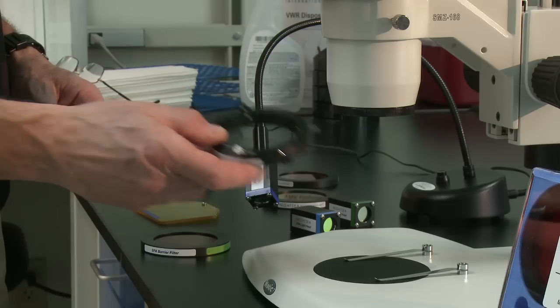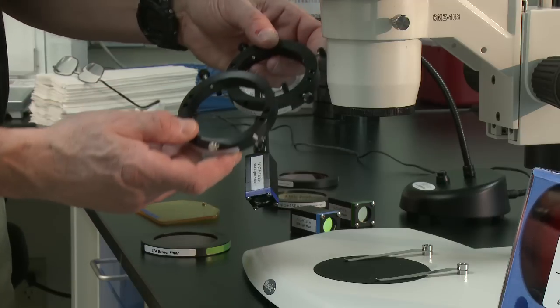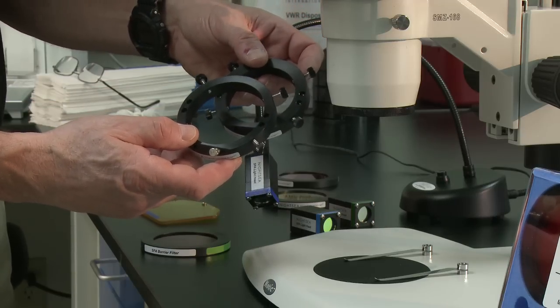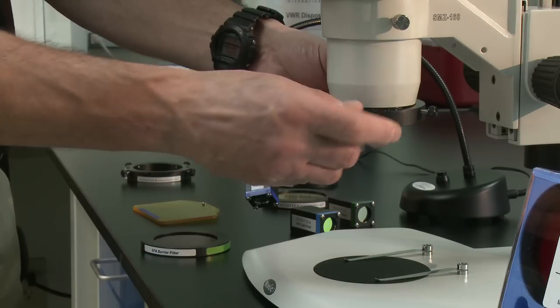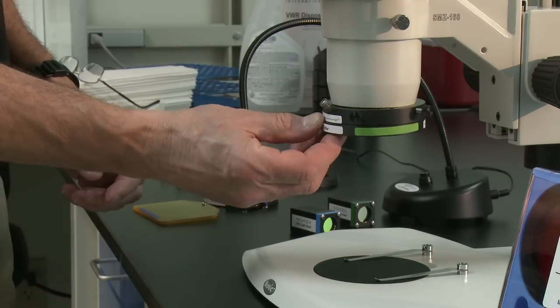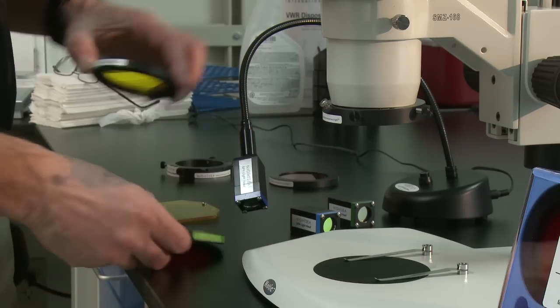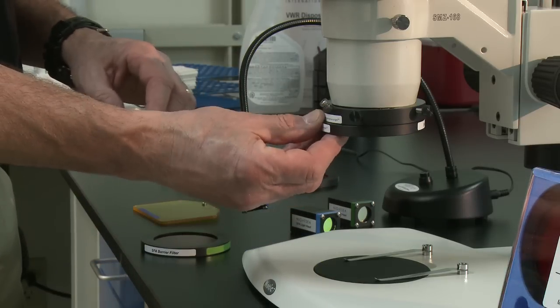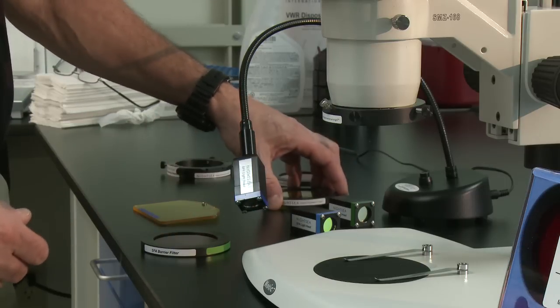To mount the barrier filters, we use an adapter ring that mounts where a ring light would attach. The adapter is available in several sizes to fit most stereo microscopes. The ring attaches with thumbscrews, and the barrier filters attach with magnets. This makes it easy to remove the filters to switch between excitation wavelengths, or to remove them entirely so that you can use the microscope for white light work without removing the adapter.